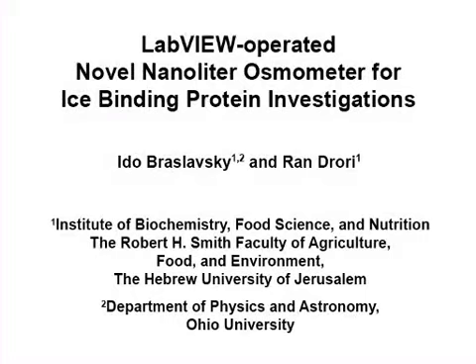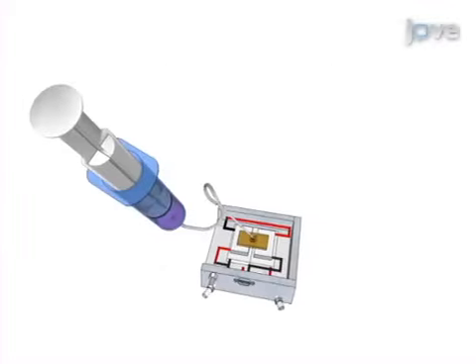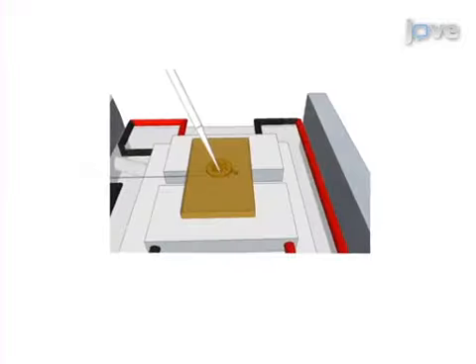The aim of this procedure is to measure thermal hysteresis of ice binding proteins and other materials that influence ice growth. This is accomplished by first creating a capillary tube with a narrow opening and aspirating a solution drop of protein.